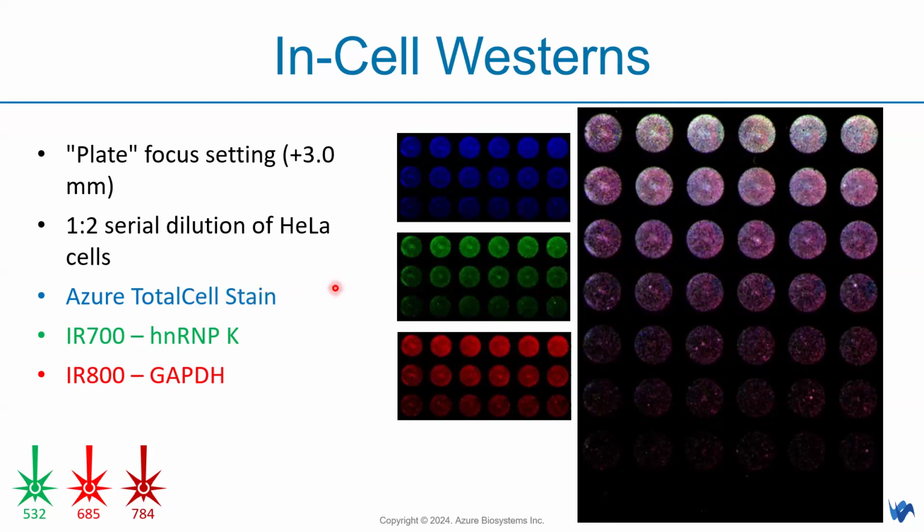You can do multiple stimulations, multiple screening endpoints, proteins of interest, or replicates on a single plate because we have 96 or 384 wells. So for one group, you may have five or more than three data points, for sure. Okay. So it offers a further improvement in high throughput data generation.